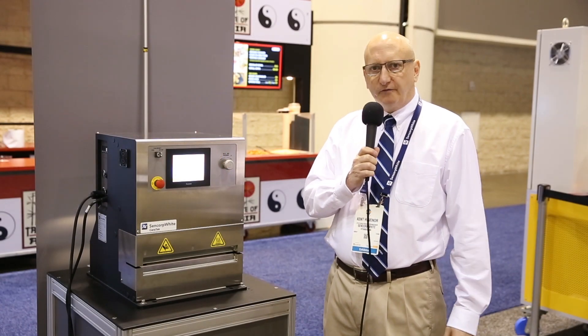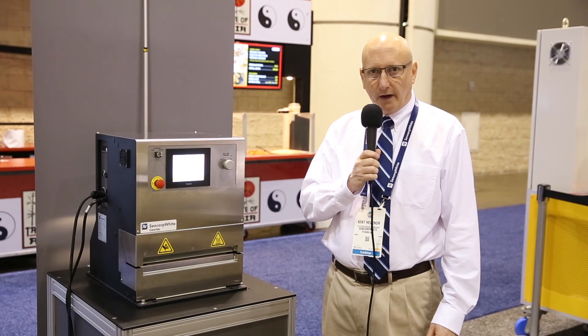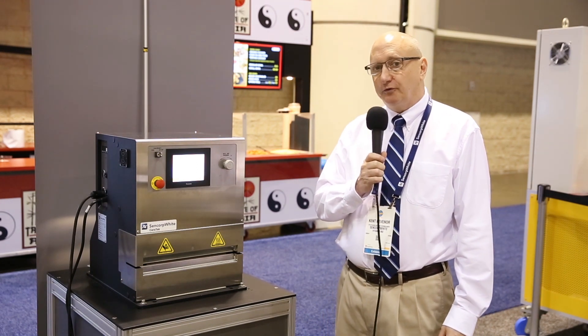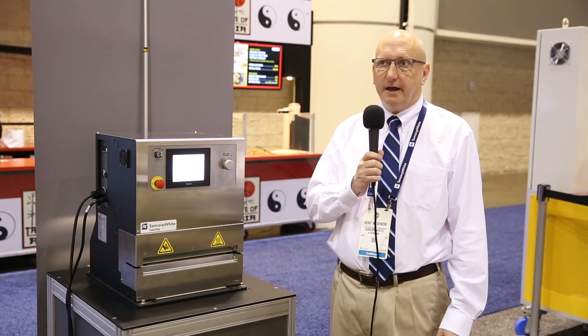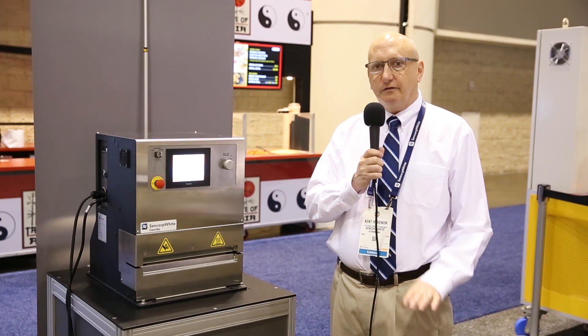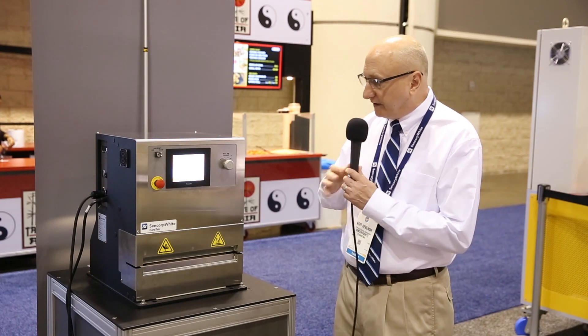My name is Kent Hevener. I'm Vice President of Sales for Sealing Technologies for Cencorp White. Cencorp White manufactures a full line of laboratory heat sealers for material testing, and we also manufacture a laboratory thermoformer for simulating the thermoforming process in a laboratory setting.